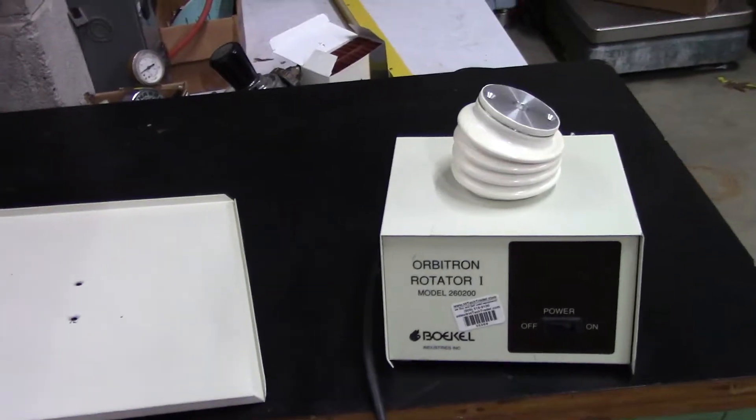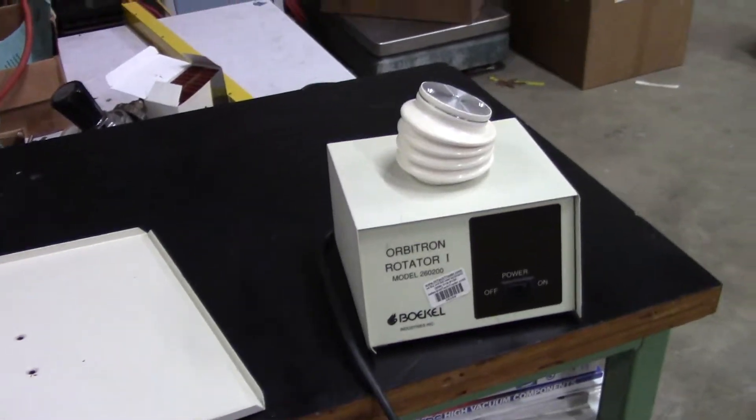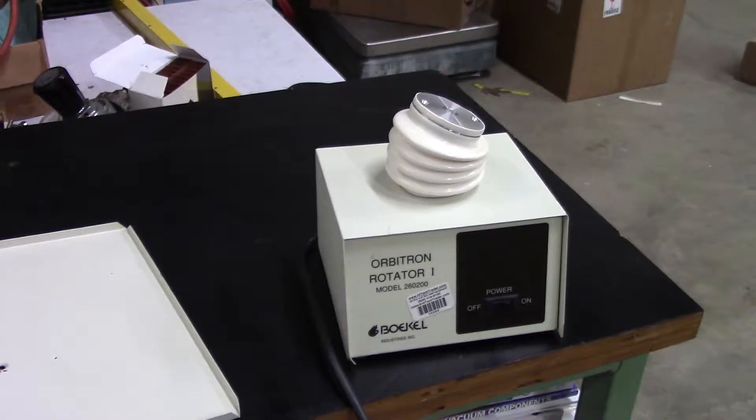Hi, this is Michael from Hitech Trader. Today we're looking at a Bokel Orbitron Rotator 1.